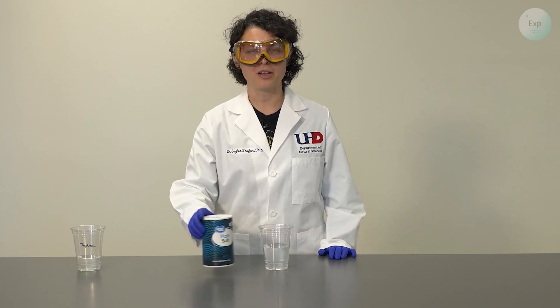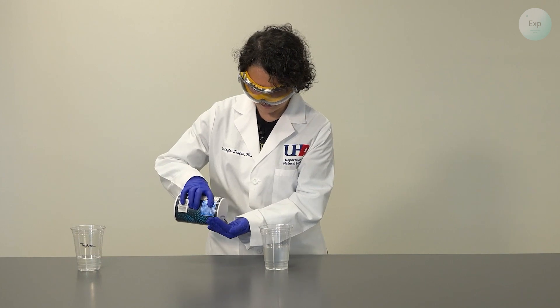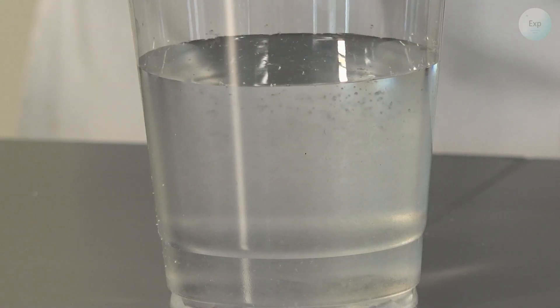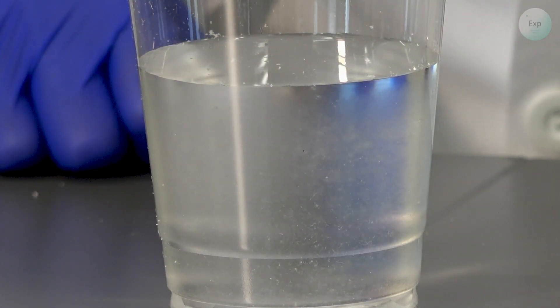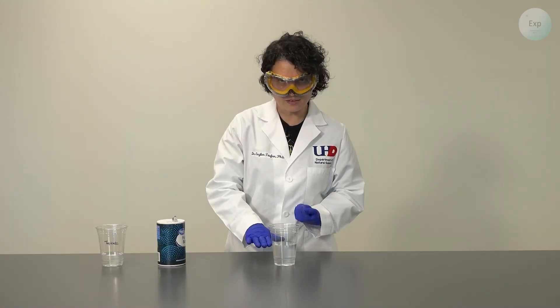I'm going to start with my polymer that was soaked in deionized water, and I'm going to add very small amounts of salt, essentially almost grain-wise. And you should already start seeing the top layer clearing up.